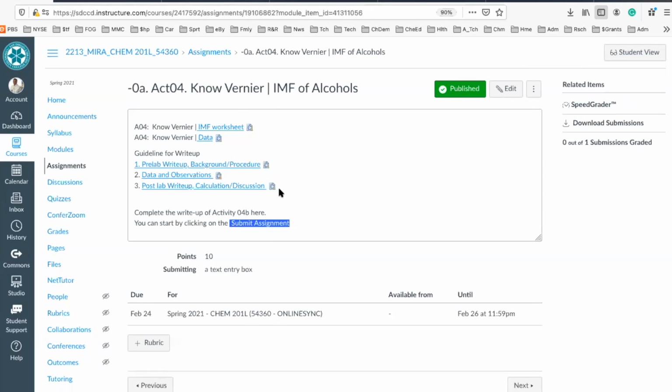Here is what I completed last night as far as guidance in your lab report. You want to use these in order to practice writing up the lab reports. Okay, so I'm going to go through each one of these so it's clear the details that I'm looking for. And you guys are at the beginning level of chemistry. I know you've already got 152 and 200, and hopefully they've trained you or given you the background in terms of writing a good report.